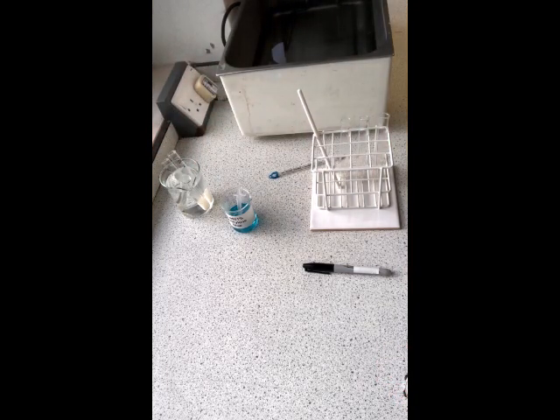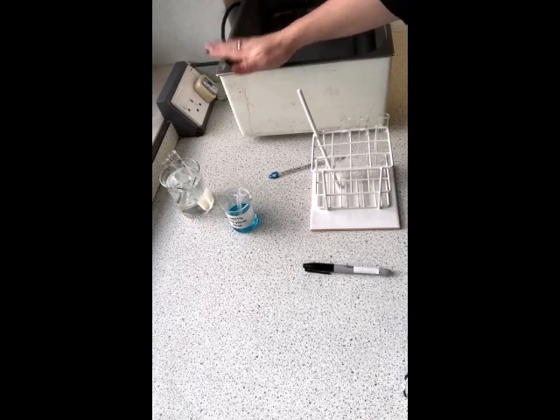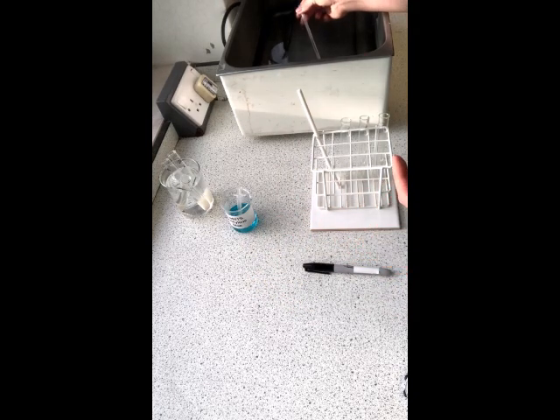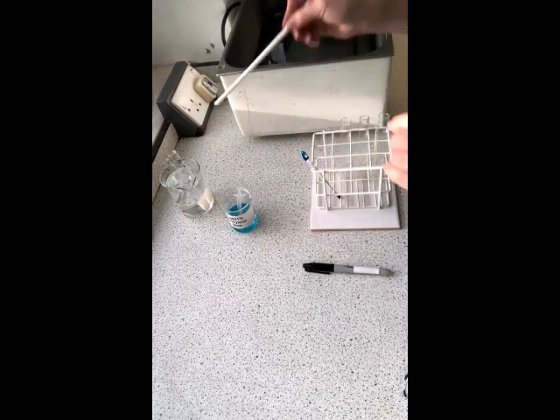Okay, so we are going to be investigating the other temperature now. So for this, we're going to be using the electronic water bath, which is set to a higher temperature. So as I say, at the moment, last time I checked it, but it's always good to double check using the thermometer, it went up to roughly 37 degrees Celsius. Okay, benefit of an electronic water bath is that obviously they are thermostatically controlled, so you get a far greater level of control than, say, if you were to use hot and cold water or a Bunsen burner. Okay, so we know that that is set to a good temperature. We'll leave this in the cradle because we'll put the entire cradle in there in a second.